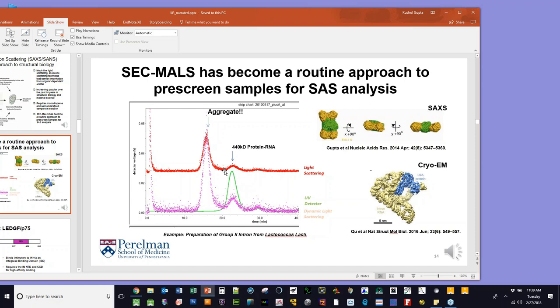And to the second part of your question, could you repeat that again, Dan? Right. So if the concentration is so low that you don't see much in the UV, why are they going to impact your X-ray scattering results so much? Right. At the end of the day, the overall scattering that is recorded is a summation of the intensity from the component parts. So if you have your signal of interest, it's kind of like a milkshake. You have raspberries and blueberries, you make a raspberry blueberry shake. There's no way of deconvoluting those two components from the overall scattering.